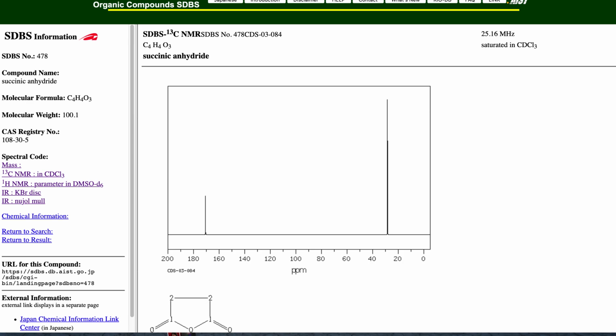When I got my PhD in 1980 from the University of Nebraska-Lincoln, I was synthesizing 3- and 4-membered rings with nitrogen. And I was also conducting what's called C13, N15 nuclear magnetic resonance to do structure determination, because at that time there was still a lot not known about 3- and 4-membered rings, particularly those containing nitrogen. Okay, so that just shows you, this little tutorial just gets you up and running. So if I say go to the SDBS and find this catalog number or whatever, you'll know how to get there and you'll be all right.